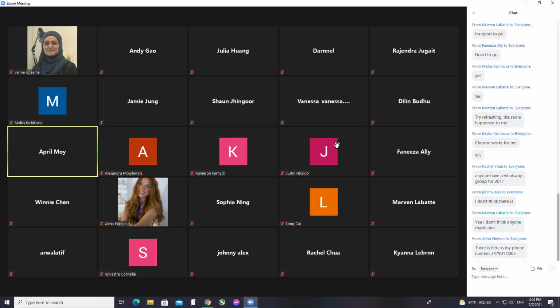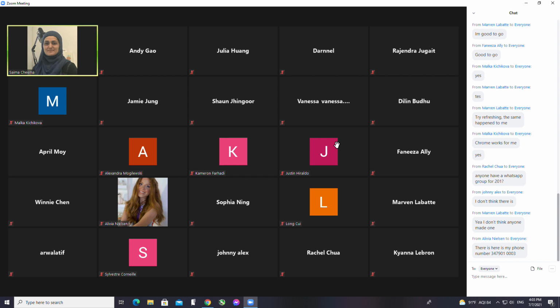Dr. Chima, from my understanding, each of us can have different ocular ruler divisions and different stage micrometer divisions, but for the last column, each ocular division in micrometers, it should all be the same for all of us. Am I correct? That's correct. Exactly. Thank you.